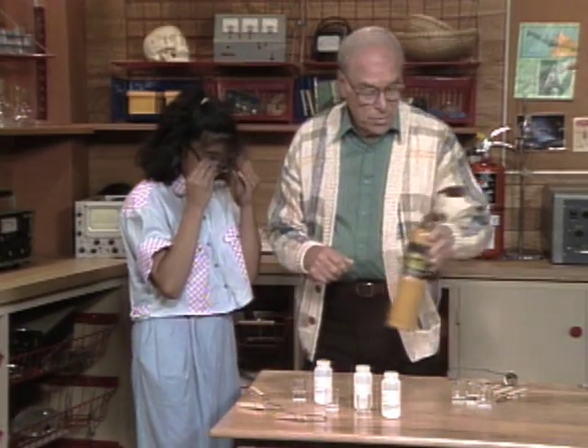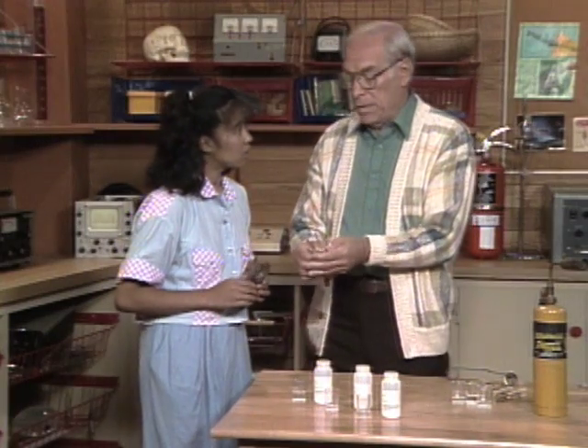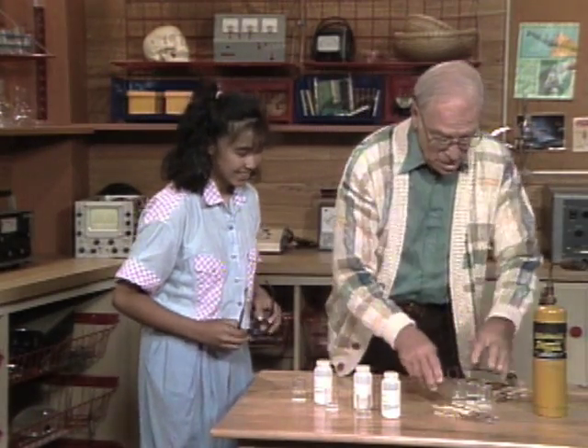By the way, if you were a real analytical chemist you'd be using a platinum loop, but I don't have any platinum loop, so we're using safety pins instead.